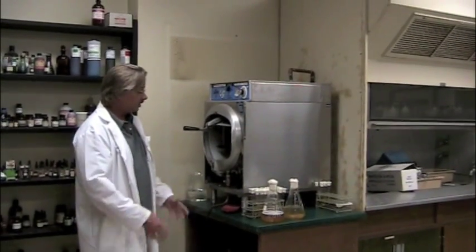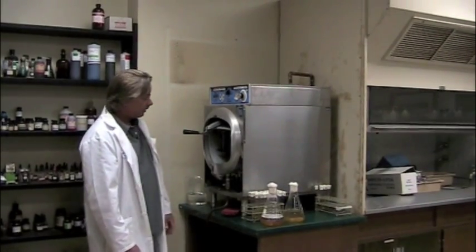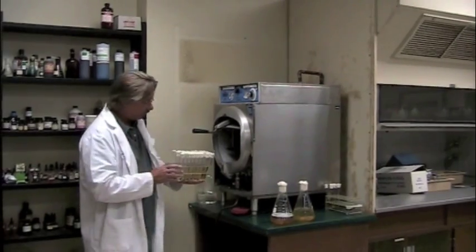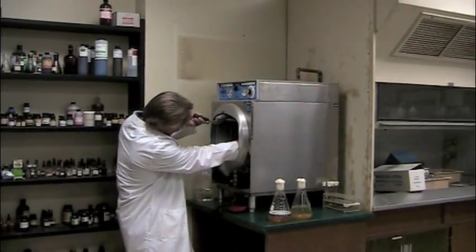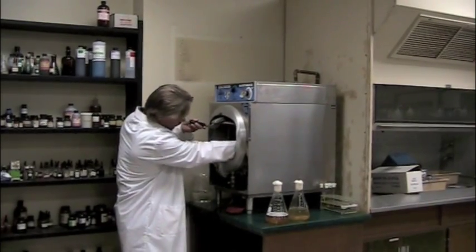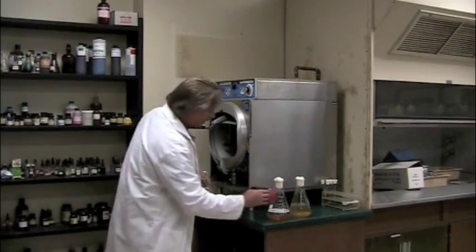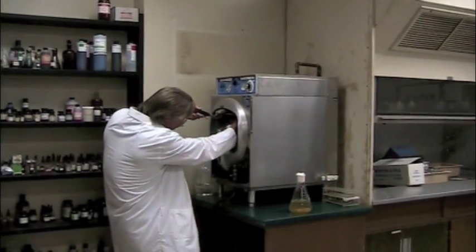What we're going to do next is autoclave the media that we've prepared for the lab. I've already got some loaded up in it, and I'm going to take this test tube rack full of media and put it into the autoclave. We've also got some flasks of broth and agar that we want to get in here.